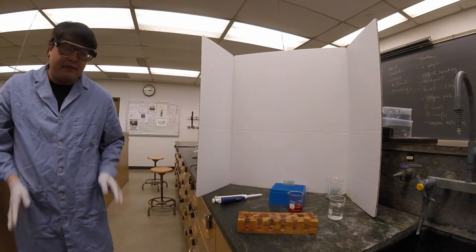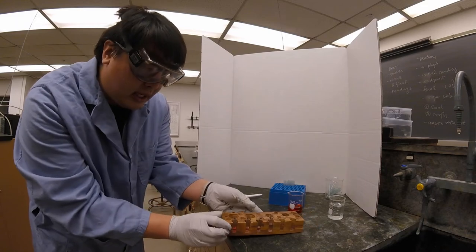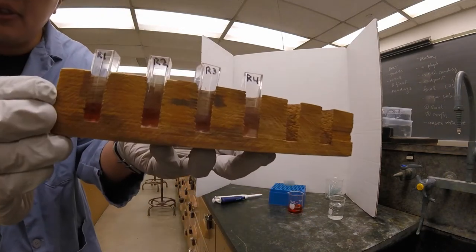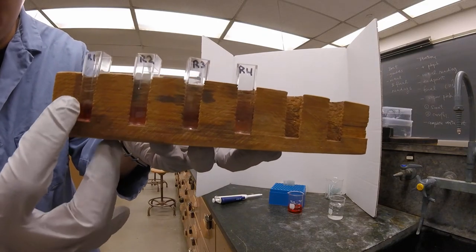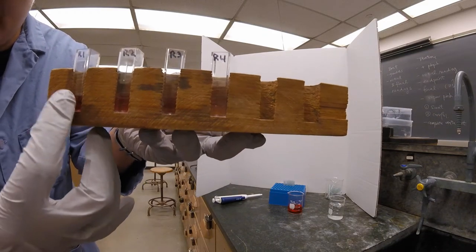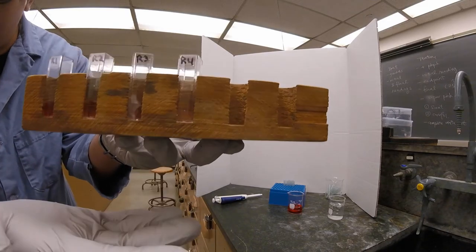So at this stage I've completed all the dilutions and I'm going to zoom in on the camera so you can see how the colors change. We're probably going to provide another picture so you can see a little more clearly but it's supposed to be very dark right here. And as you go along this way it should get lighter overall.